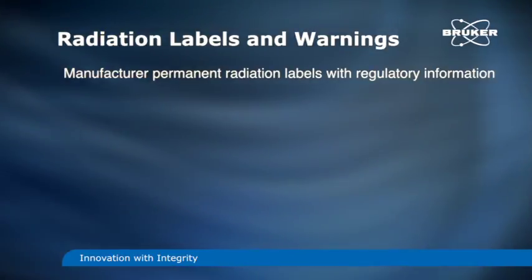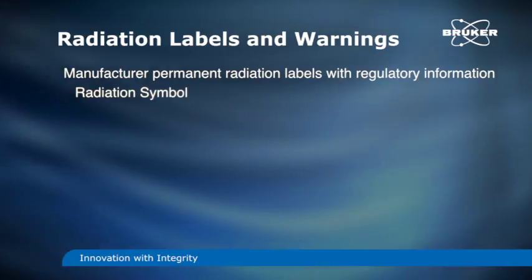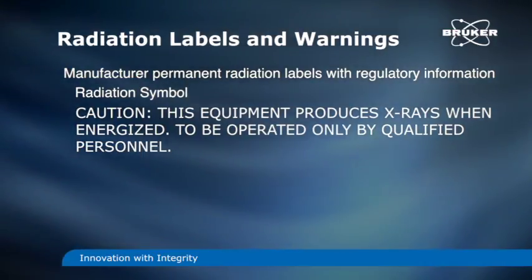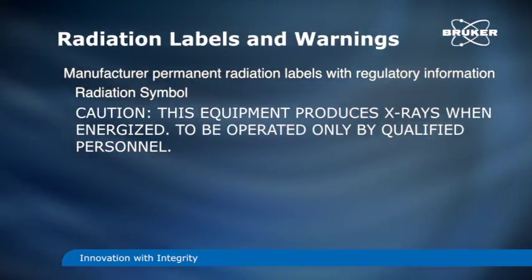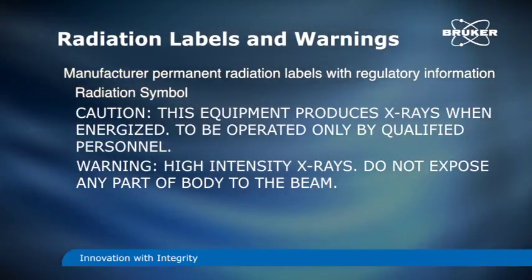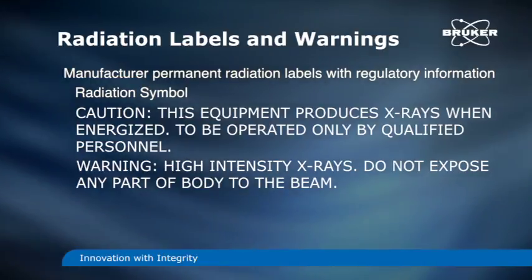Safety warning labels identify the analyzer as a radiation-producing instrument. The manufacturer mounts radiation warning labels at the factory. Each instrument contains the words, "Caution. This equipment produces X-rays when energized, to be operated only by qualified personnel," and "Warning, high-intensity X-rays. Do not expose any part of the body to the beam." Bruker's name, address, and telephone numbers are readily available under the analyzer housing near the handle in case of an emergency or other customer needs.